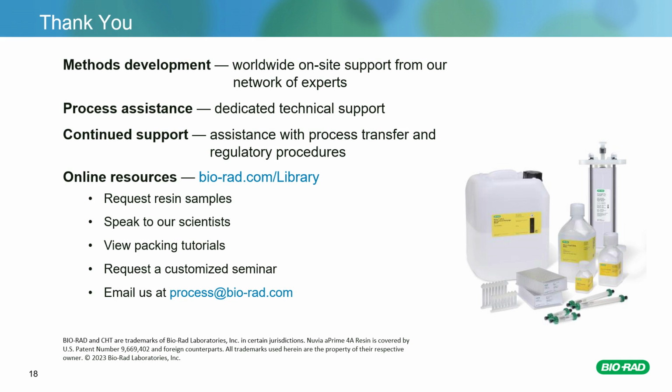And our next question is, has a mixed mode resin replaced an IEX and HIC steps in industry? Is there viral clearance data?